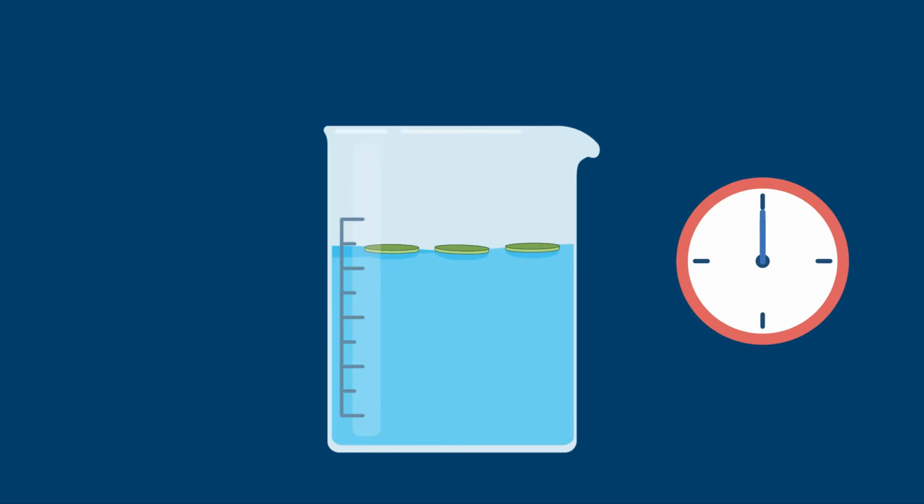We'll time how fast the flotation takes and use that as an estimate of photosynthetic rate. I'll go through that in much more detail as I walk you through the experimental setup.